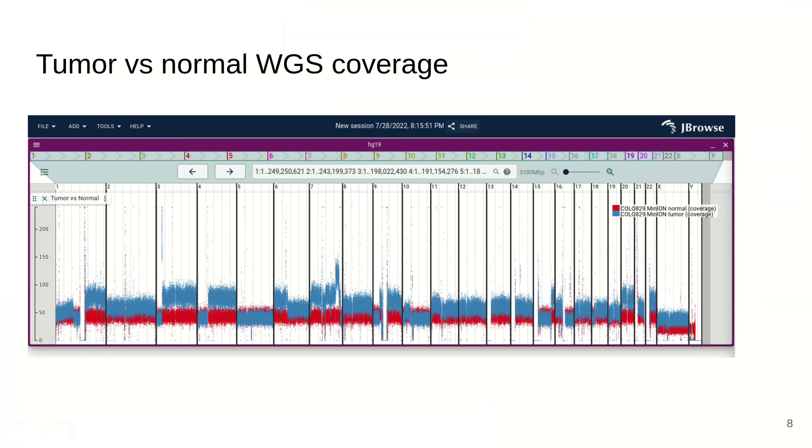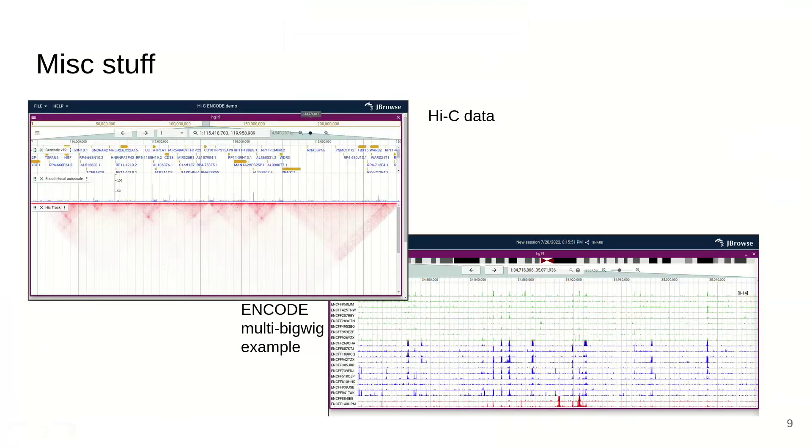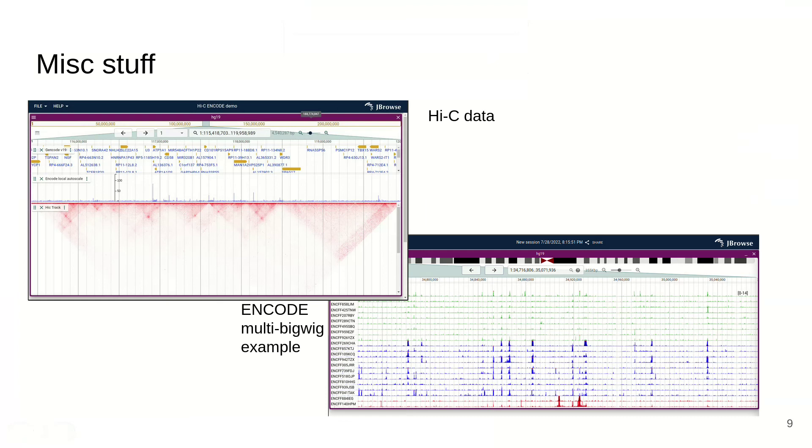There's other miscellaneous features. We can view Hi-C data using the .hic file format from juice box. Hi-C can often be used for visualizing structural variants and checking genome assemblies too. Also, this multi-bigwig example from ENCODE data shows a bunch of ChIP-seq tracks that are all stacked up and synchronized to the same Y-scale using this multi-bigwig track type.